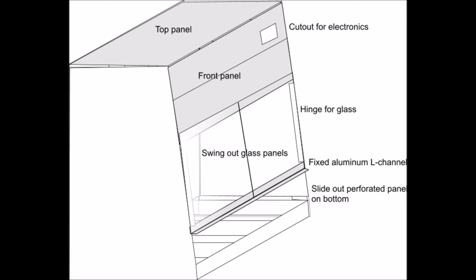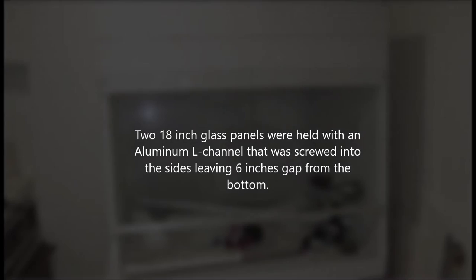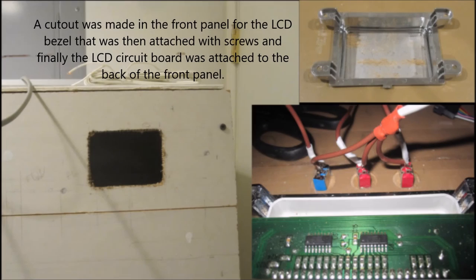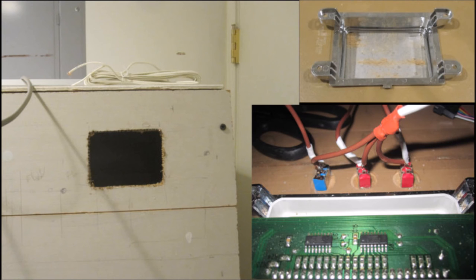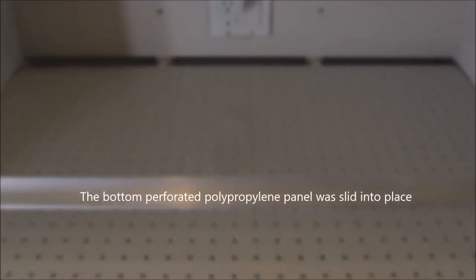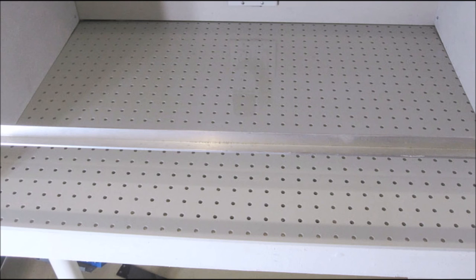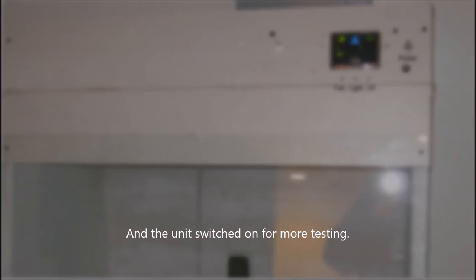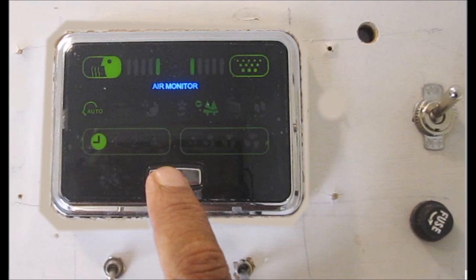Then I wrapped up the enclosure. There's a top panel, a front panel with a cutout for the electronics, and I used two 18-inch glass panels held with an aluminum L-bracket on the bottom. I cut the electronics hole in the front panel, attached the bezel from the air cleaner and electronics, and slid the polypropylene bottom panel into place. Once everything was in place, I put in the glass and top panels, switched it on, and did some more testing.